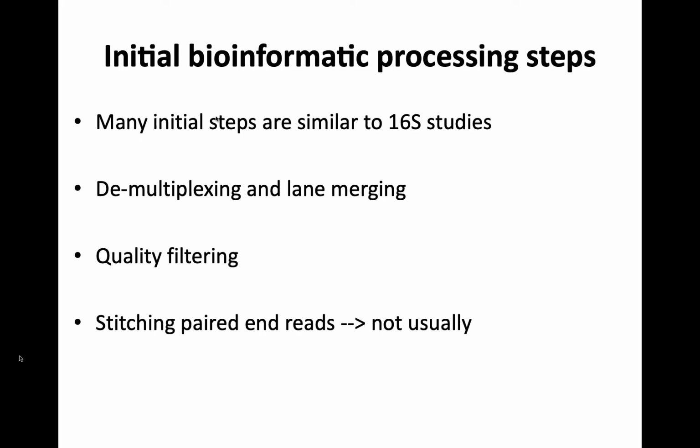There's some selection a bit on size, but they'll vary. That means when you do a forward read and a reverse read, they'll often not overlap, right? Because you'll have, say, a 1,000 or 500 base pair fragment. You do either end and they're not going to overlap. So typically we don't stitch reads because they just won't stitch together successfully.